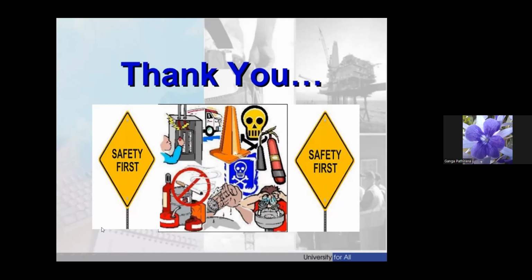In our laboratories, even though the fire extinguishers and everything are there, they are mostly not up to date. According to my knowledge, these fire extinguishers have to be replaced after a regular period of time, which is not happening in our laboratories.